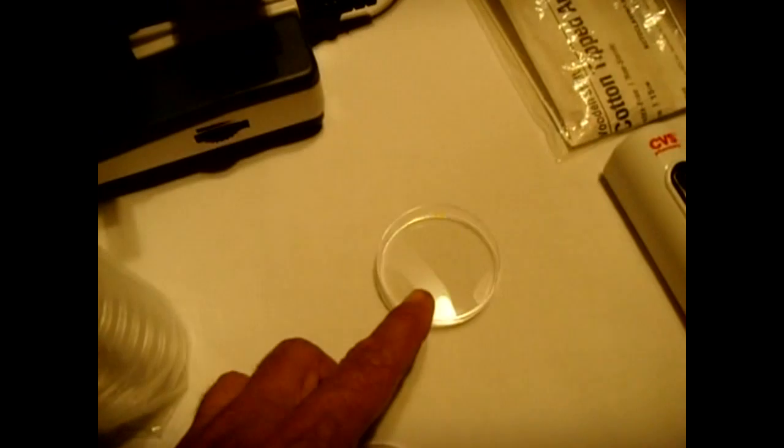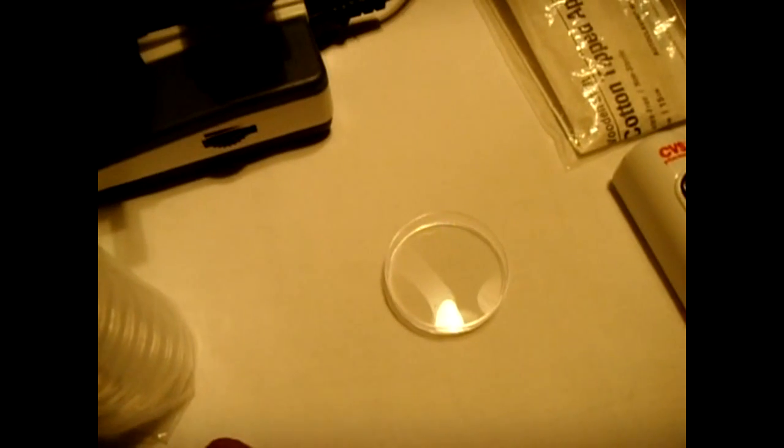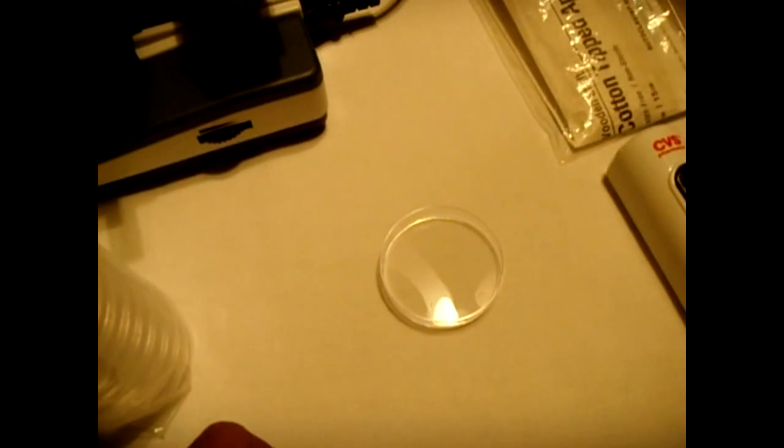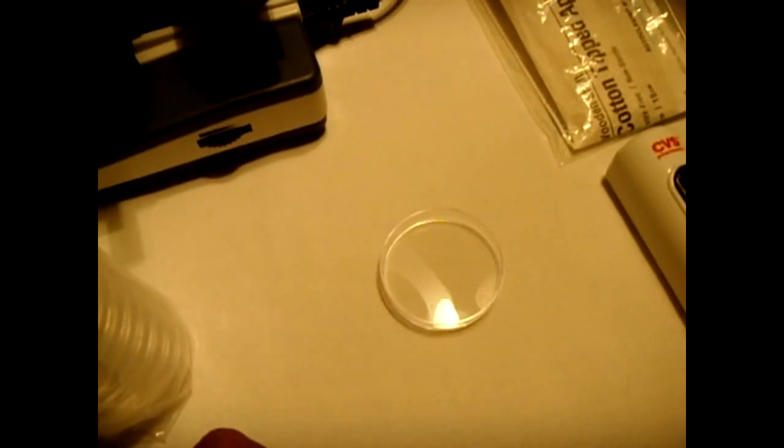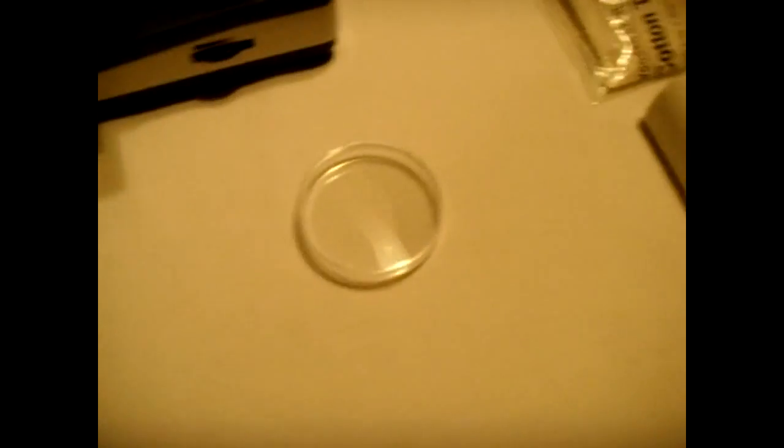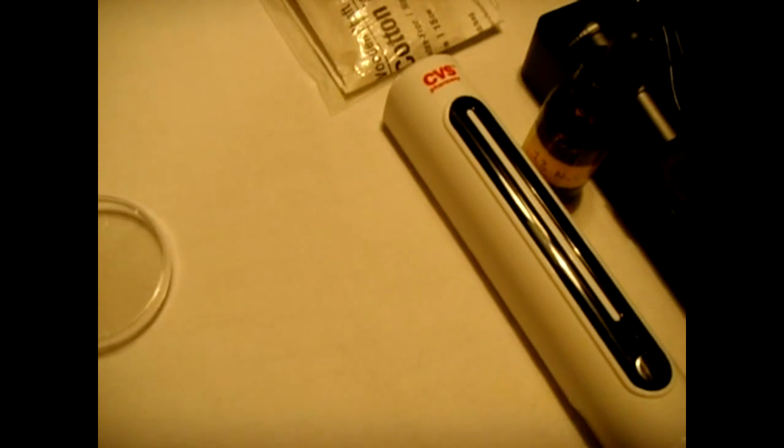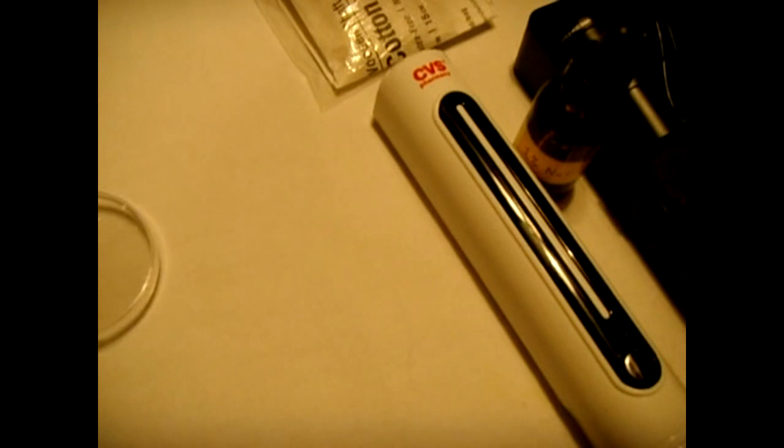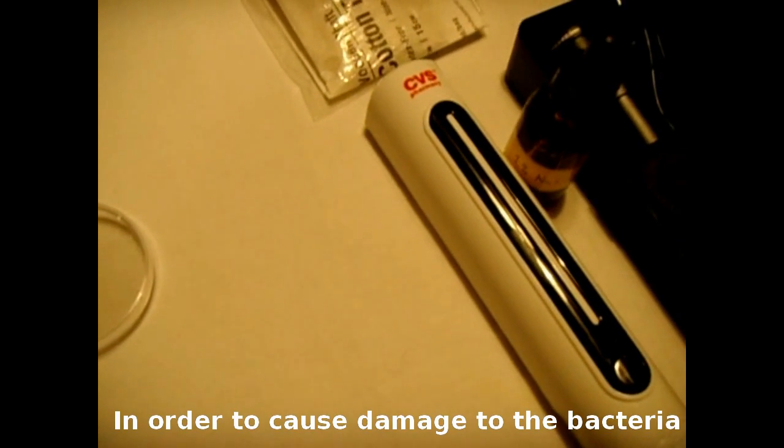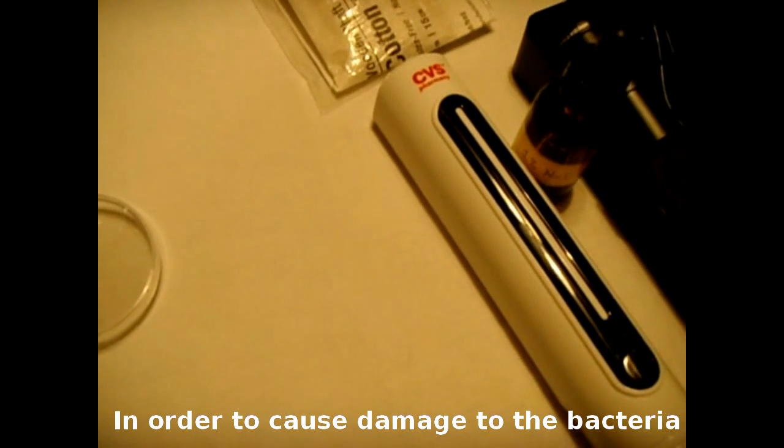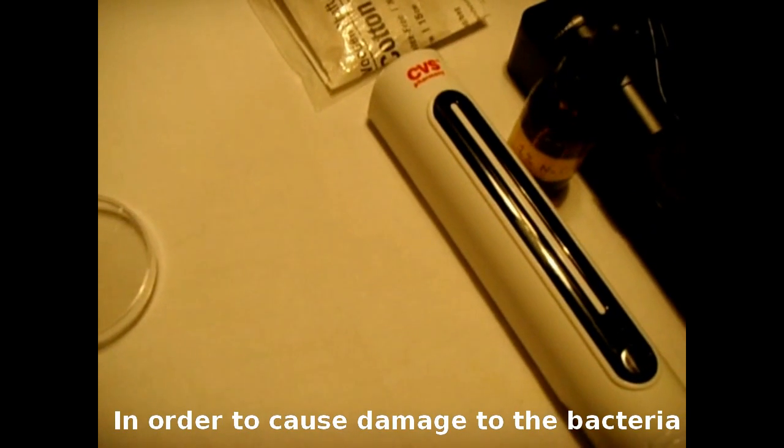If you did see colonies growing, that means your UVC treatment did not work. Now just because you turn on a wand like this and bring it over a surface does not guarantee you're killing all the bacteria and viruses. You want to make sure the light is in contact with the bacteria for a long enough period of time and you also want to have it very close to the bacteria. So from this test we can conclude that the UVC light does not kill the bacteria once it's been shined on the bacteria, but over time that bacteria will no longer multiply and die.